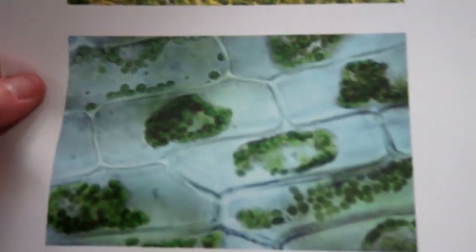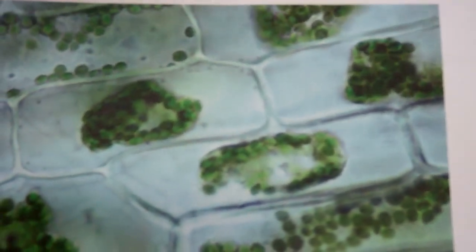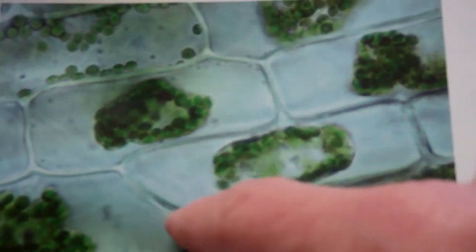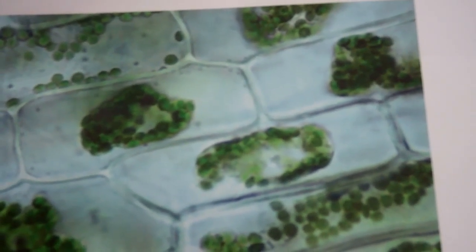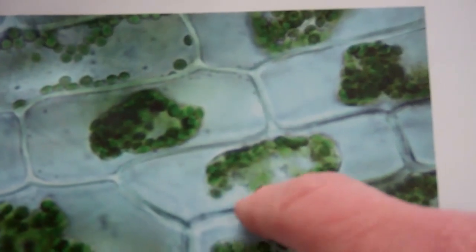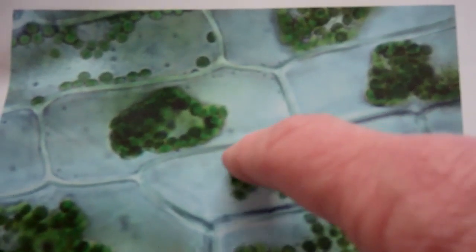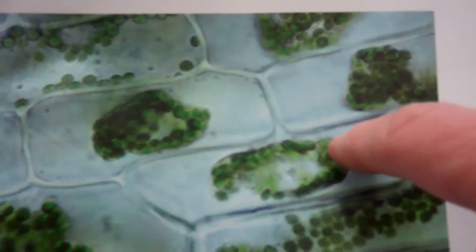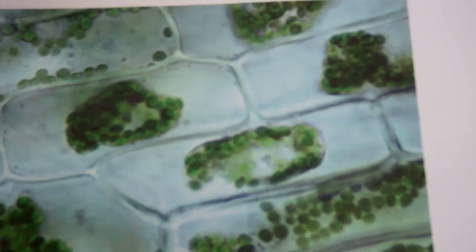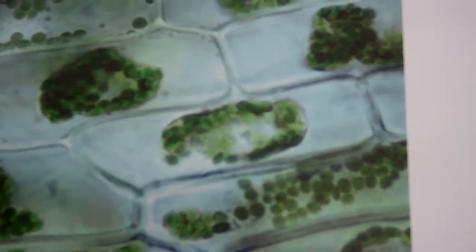You will see something that looks like this. Now, we still have the cell wall, which is this kind of grayish line, rectangular-like shape. But all the chloroplasts have kind of shrunken into the middle of the cell. And they're kind of balled up or bunched up in the middle. And where I'm tracing my finger, that is where the cell membrane is. So all of the water came out of that cell.